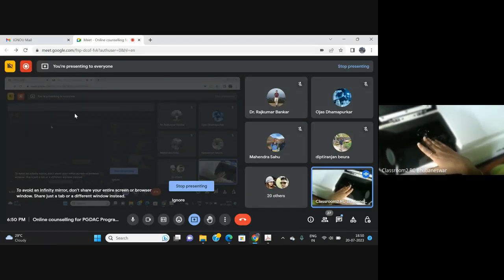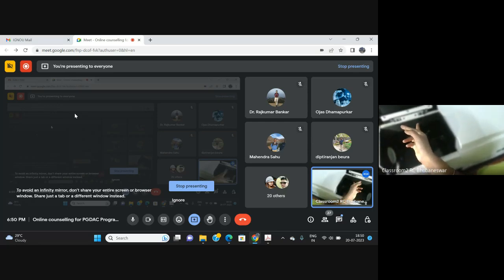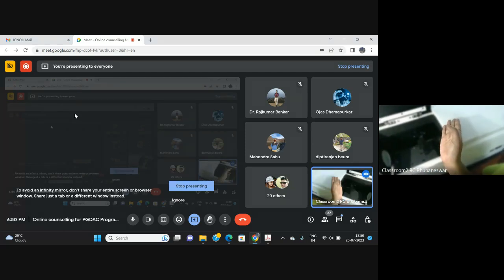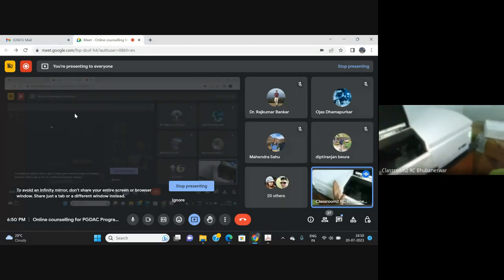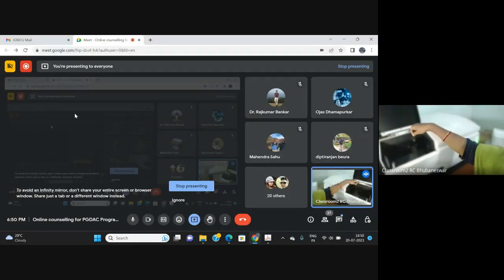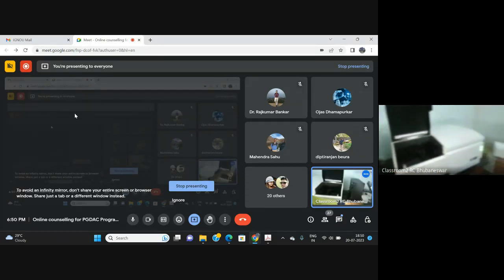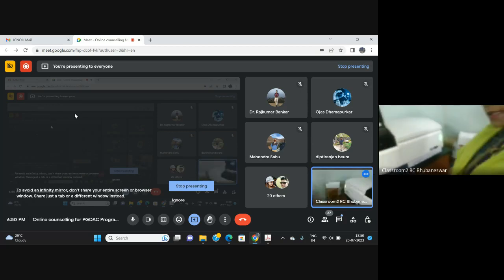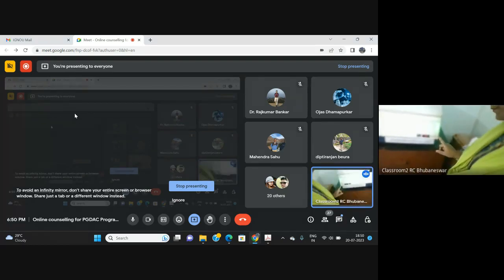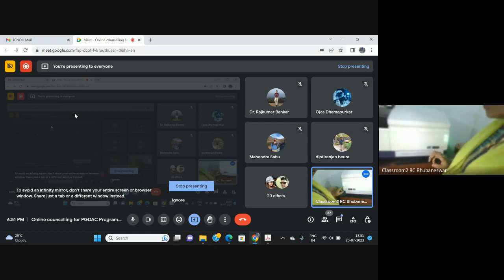We will be able to see only the sample compartment, but inside, where the light source, the xenon lamp, is, or this side where the monochromator is, that is optically designed and we cannot see. But here we can see the sample compartment. We'll put the sample, then the output device. Here you can see these green lights. This is the xenon lamp indication that it is on.